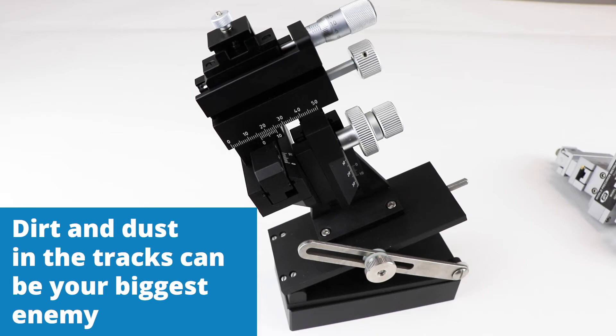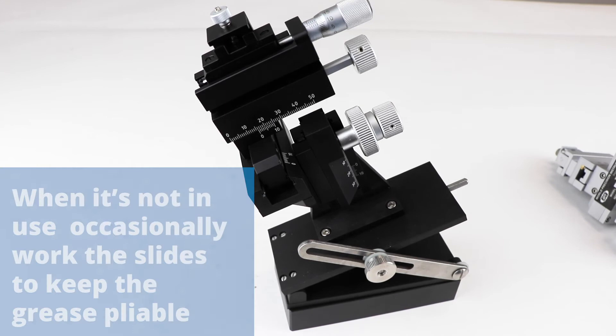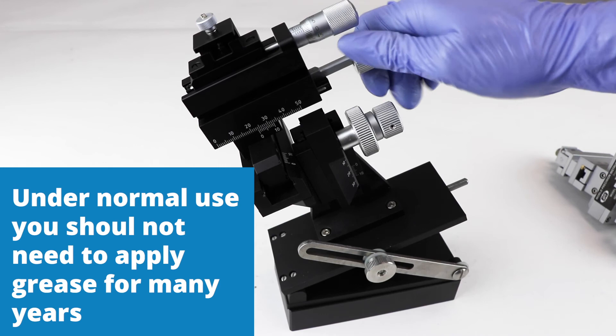Dirt on one of these things is your biggest enemy — it gets in there and clogs the little mechanisms. If the manipulator is not in use for a long period of time, you want to occasionally work these slides to keep the grease pliable. Don't ever oil the guide surfaces, and under normal use you shouldn't even need to apply grease for many years — just work them back and forth to keep the grease pliable.